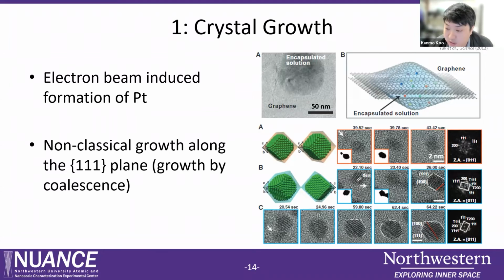In this work, platinum salt precursor solution is encapsulated in the GLC and reduced with the electron beam. They observed non-classical growth of nanoparticles by coalescence at the one-one-one plane, which is less covered with other molecules.